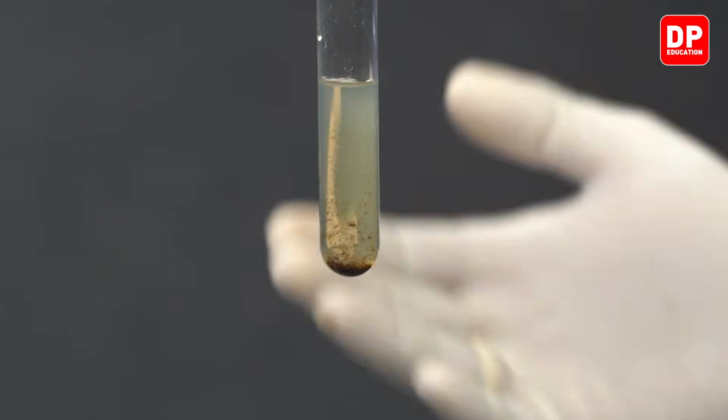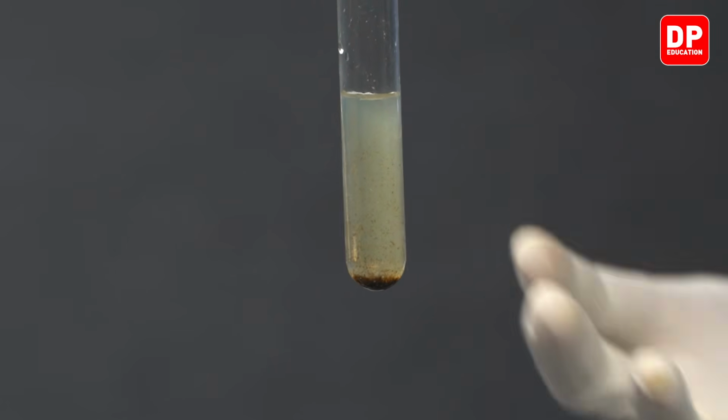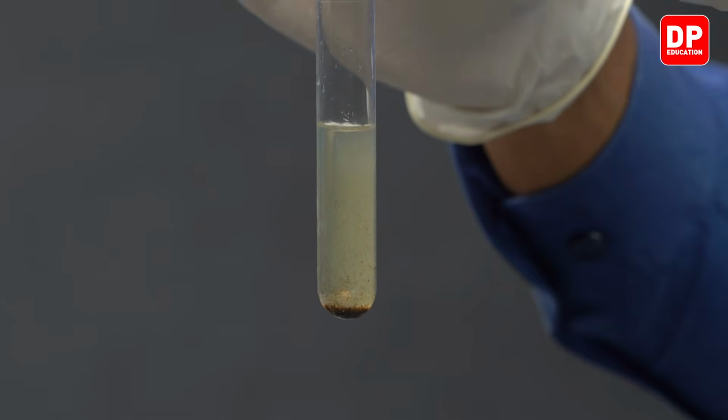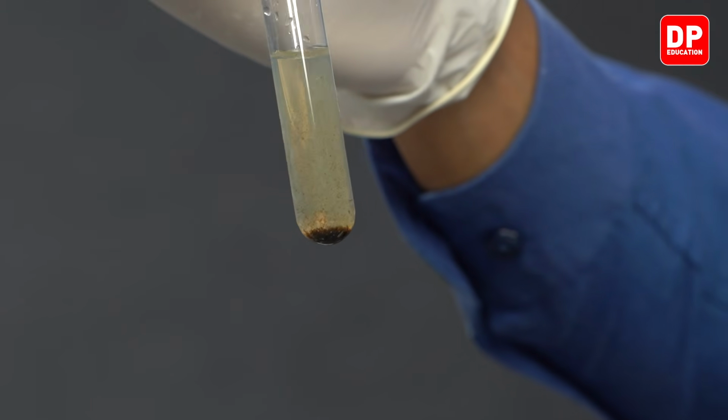As it turns into silver sulfide, it for a while appears brown, but after it completely turns into silver sulfide, it will be very clearly a black color precipitate that is formed at the bottom of the test tube here.